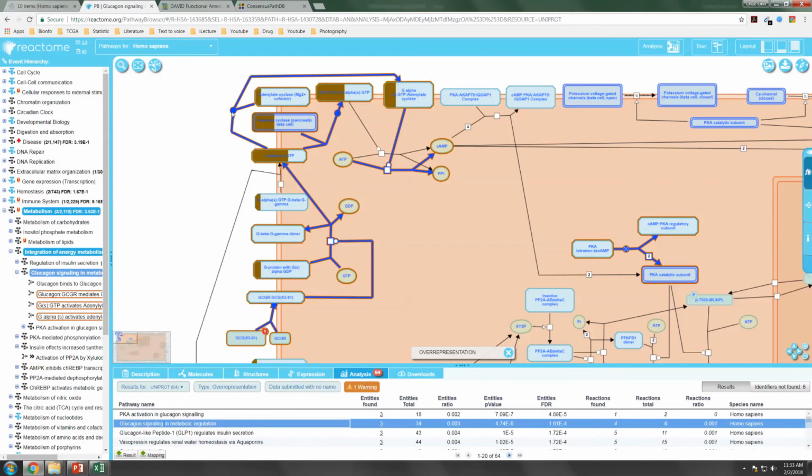So these are the nodes, the biochemical mechanisms, that your mutation might be affecting, and how this affects the gemcitabine response will serve as a hypothesis that could be further tested in an in vitro or in vivo model.